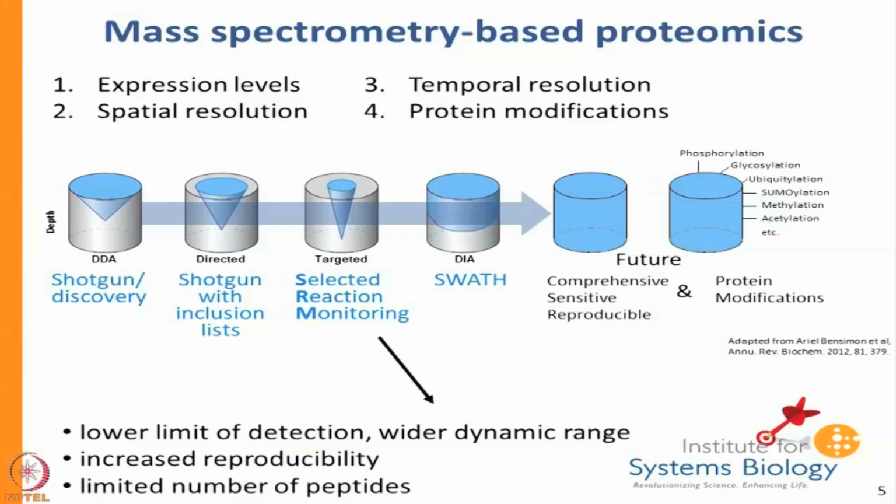So SWATH also, in the main way it's analyzed, depends on previous information. SWATH isn't quite as sensitive as SRM, but you can see that basically it analyzes everything. That's because with these three techniques, there are peptides eluting, you select one, you fragment it, and you interpret it.